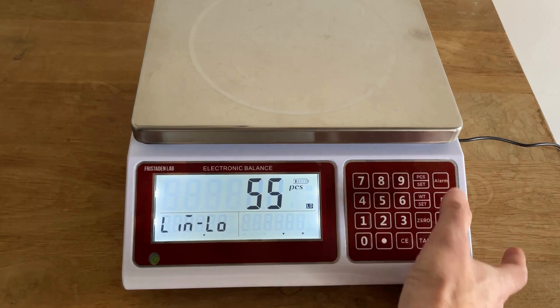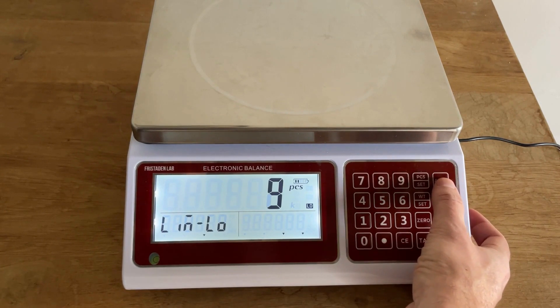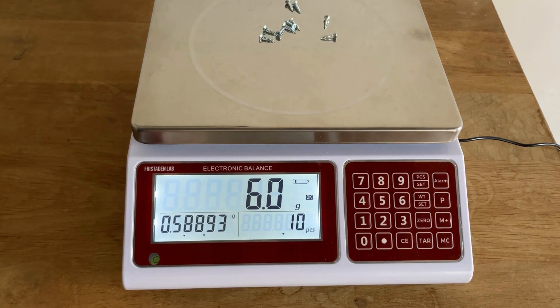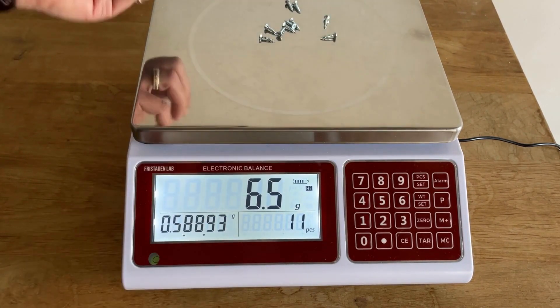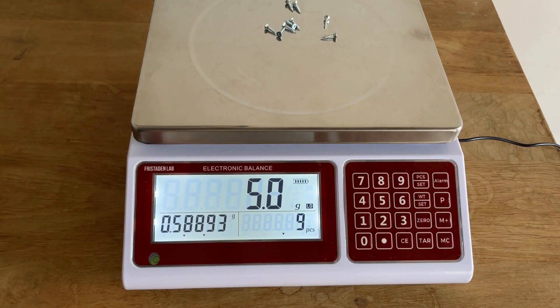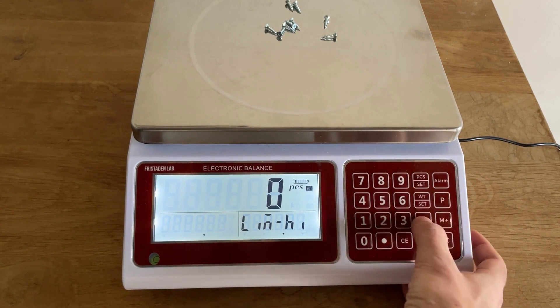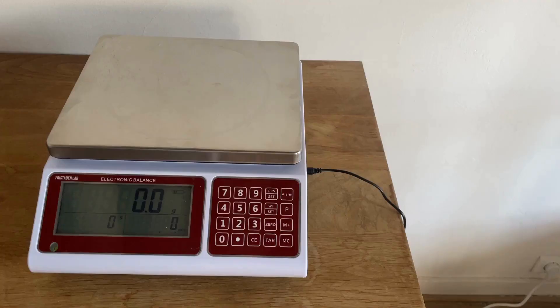Set 11 pieces as the upper bound and 9 pieces as the lower bound, then press alarm. With 10 pieces on the scale it shows 'OK,' but adding one more triggers 'High,' and removing one shows 'Low.' This lets you accurately verify correct inventory so you don't send too much or too little. To exit, press alarm, enter zero, press alarm again, and press C — that clears it all out.